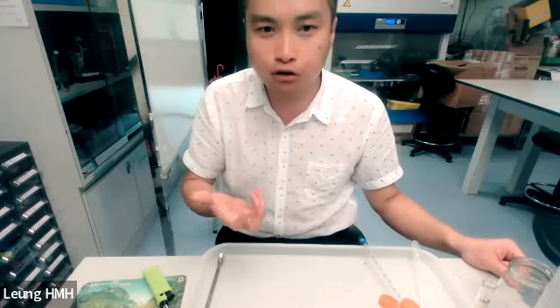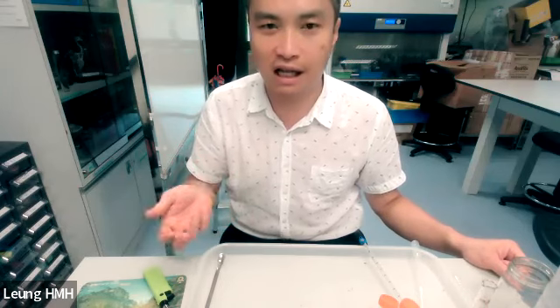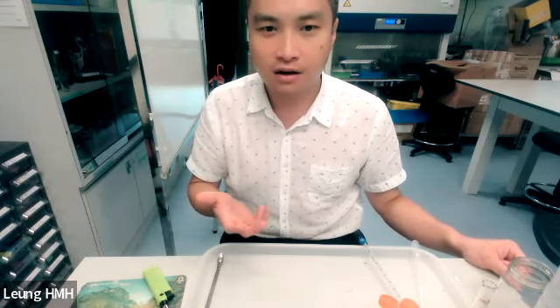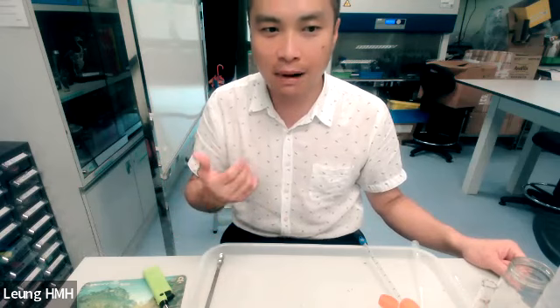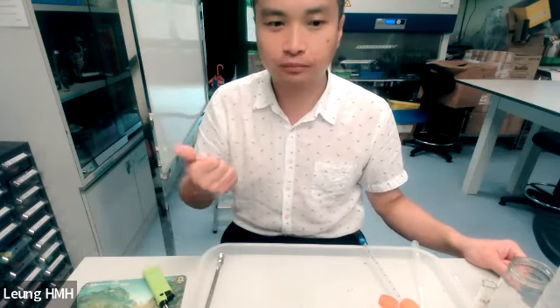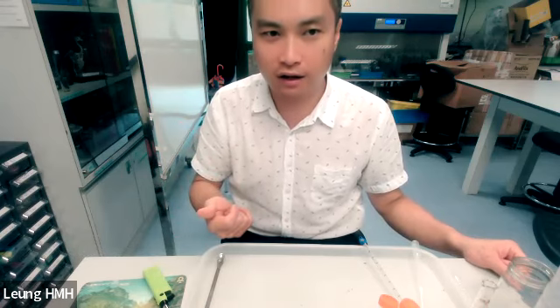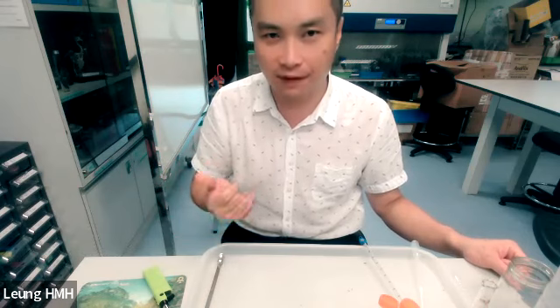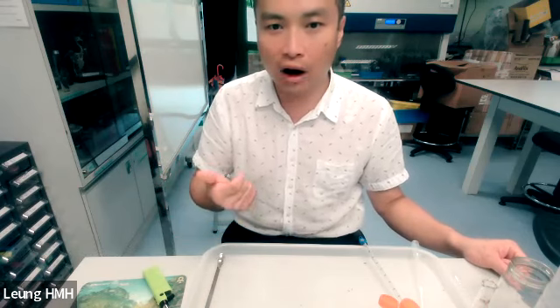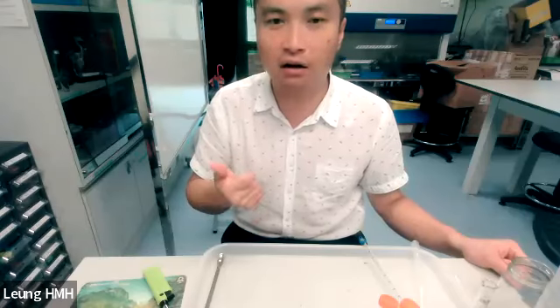How do we make sure the product can be used commercially? As I mentioned before in the lecture notes, we use gas chromatography-mass spectrometry to test whether there is a peak present in the mixture.